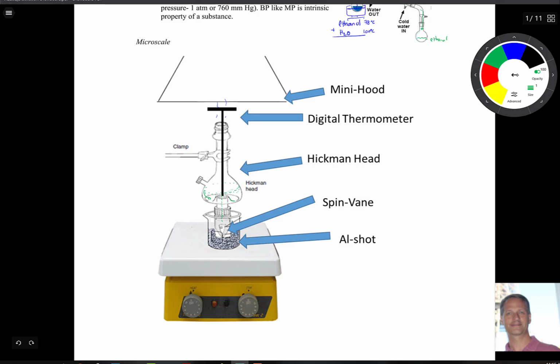You guys can see there's like a dip there. So to get this out, you would just take your cap off and you would stick in, right, your pipette or something like that. It goes into the well there, and you pull it out. So pretty straightforward thing to do.